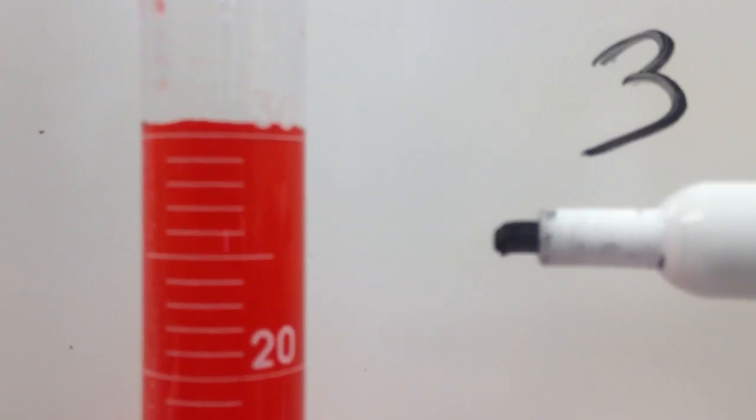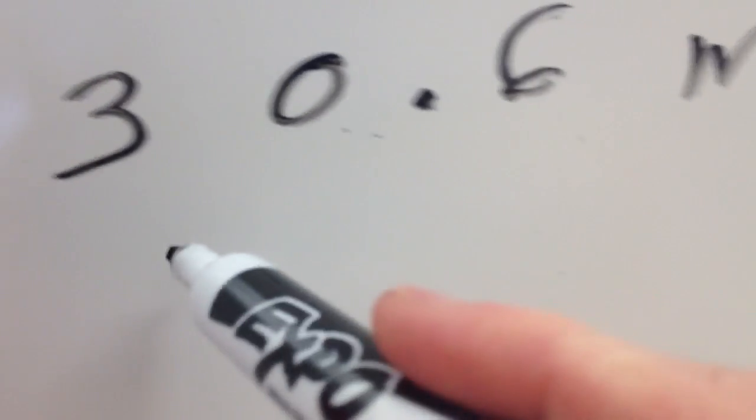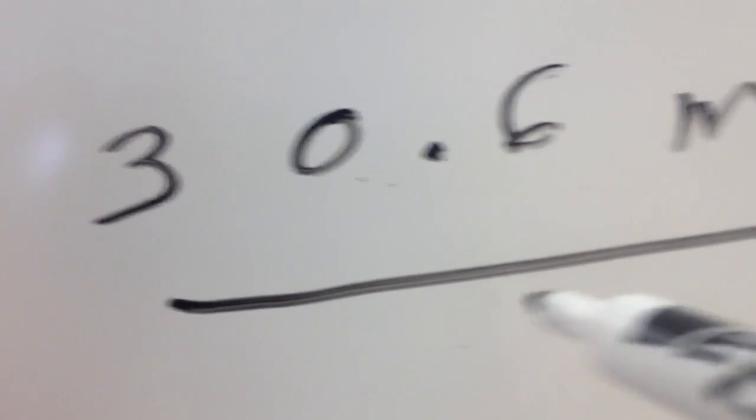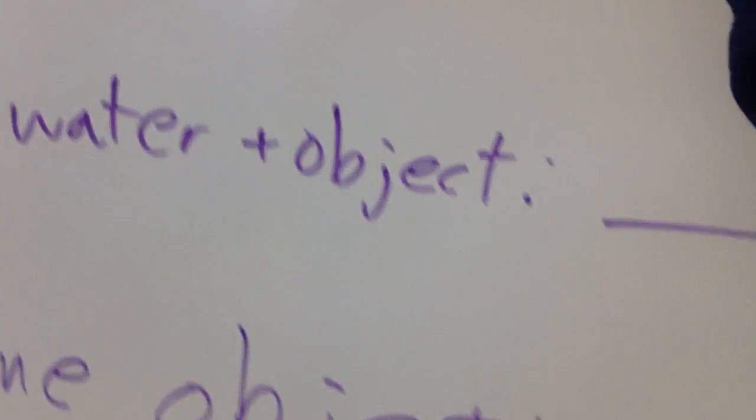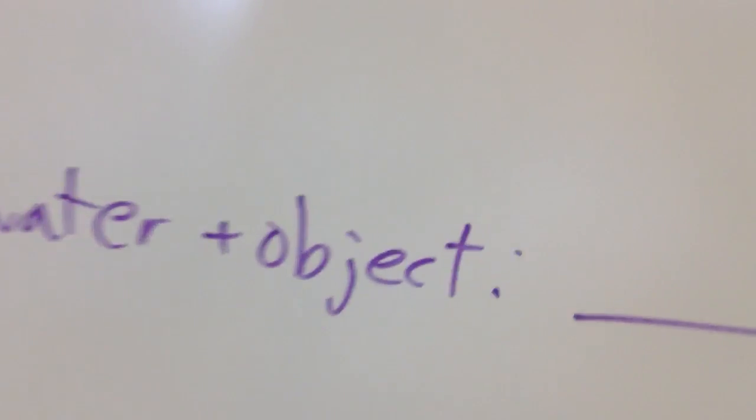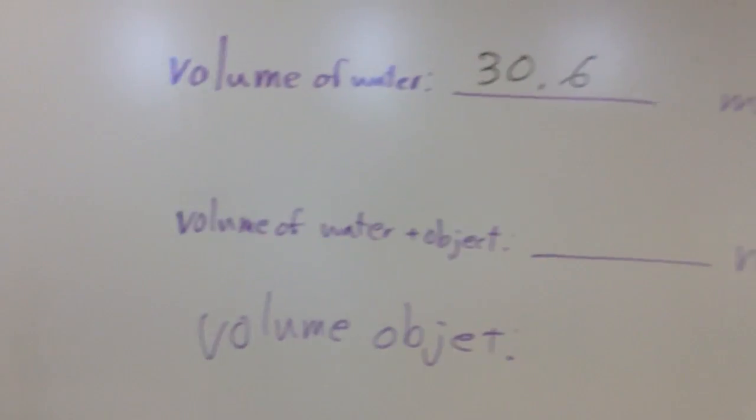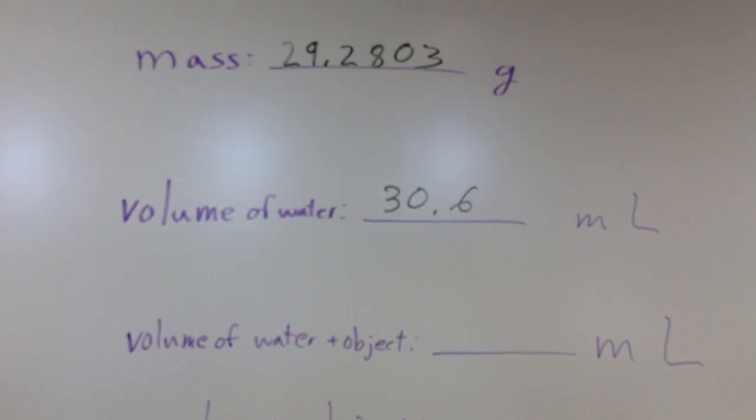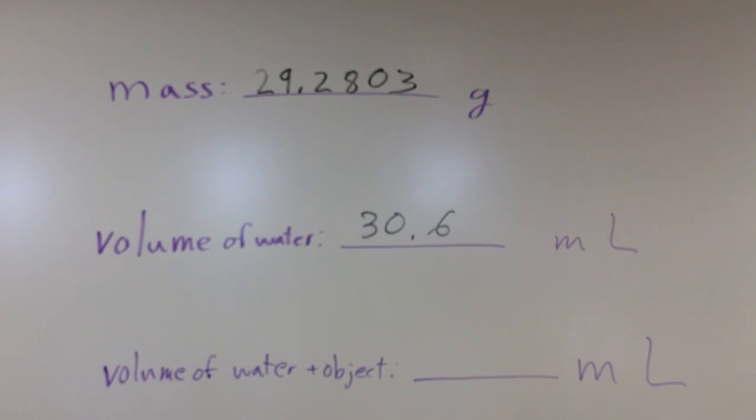So I can estimate one more sig fig than my graduated cylinder is calibrated for. So everything in your lab, in terms of volume, should have at least three sig figs for your volume readings in your graduated cylinder here. So I've got the volume of my water as 30.6 milliliters.